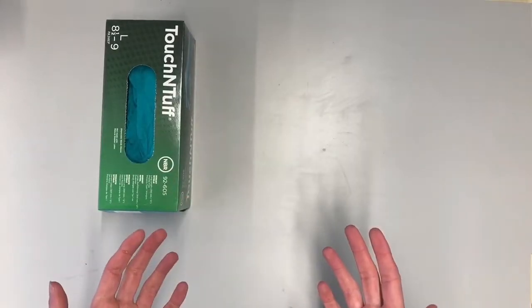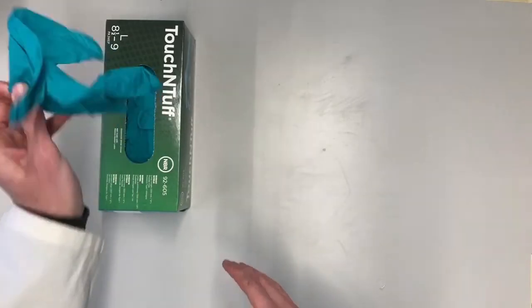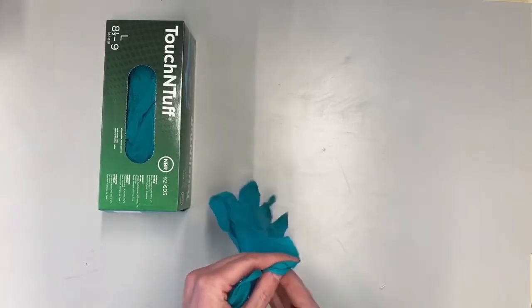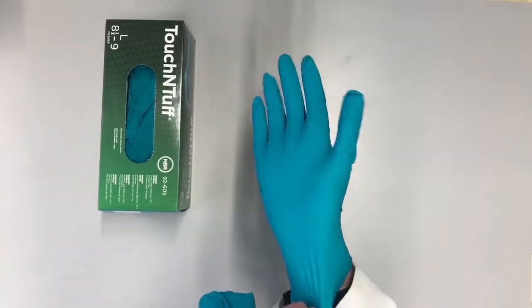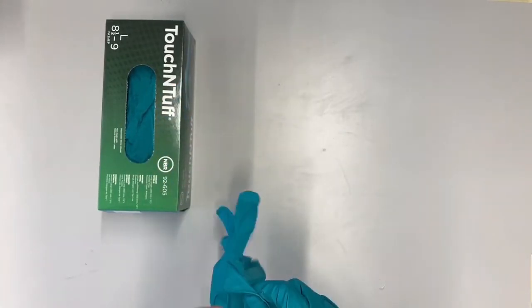When you start working with chemicals, and only when you work with chemicals, you can put on gloves. Just take two from the box and put them on your hands. The ones we have have a designated thumb, so place the thumb in that part.